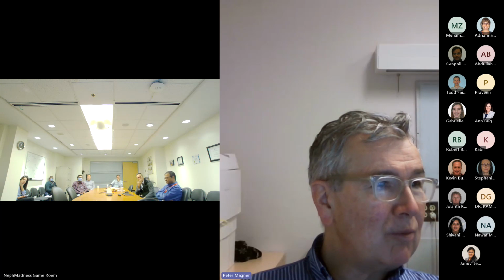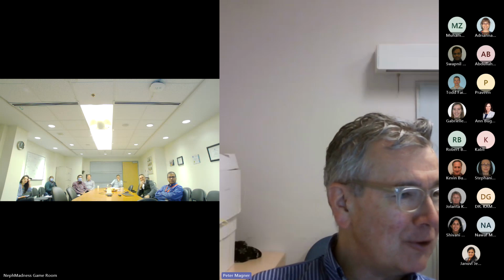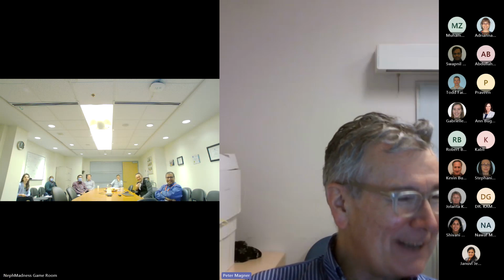Peter's got a question. Oh, Peter, you had a question. Mostly a comment. I hope you recorded this, because this is one that you fellows should look at. Secondly, nobody ever gave us a lesson with the new microscope we got a little while ago, so I think most of us don't know how to use it. If somebody figures it out, they should give us all a lesson. And we should get some stains and get back to doing this. And if you're at the Civic, where half of the AKI happens, nobody knows how to find a microscope at that campus.